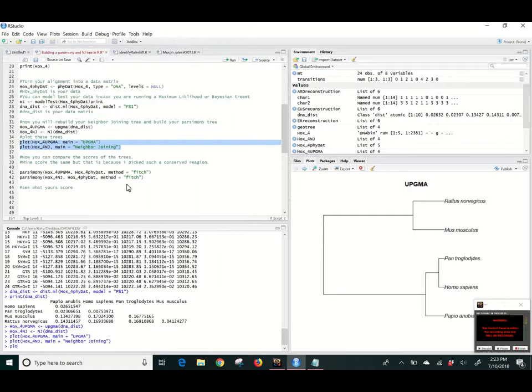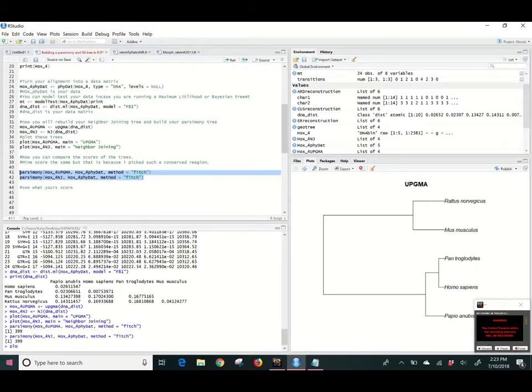Okay, then this is really obvious because the sequences are so similar, and I only have 5 things. But we can run the scores for each tree, how well supported they are. They actually get the same exact score. It's just because there isn't enough variation.